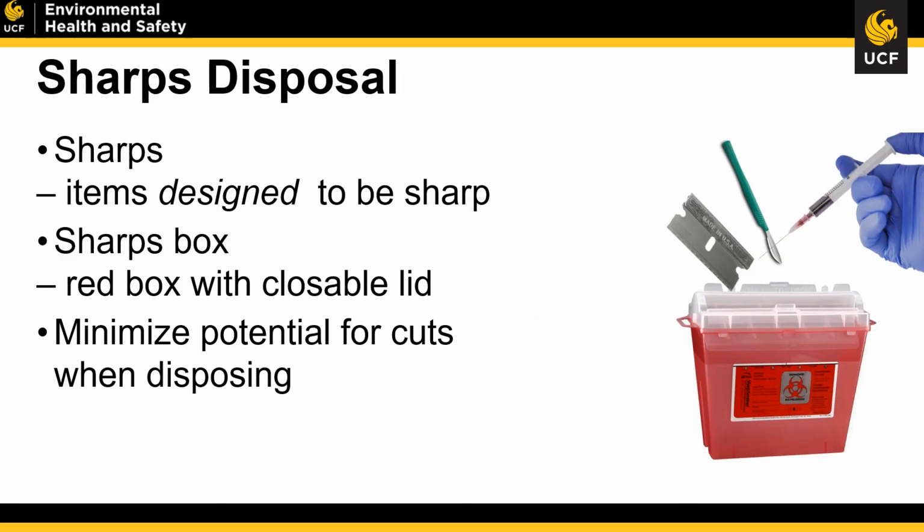Sharps disposal. A sharp is anything in your laboratory that is designed to be sharp. That means razors, scalpels, and so on. Those do need to be disposed of within a sharps container. A sharps container is a red box with a closable lid.